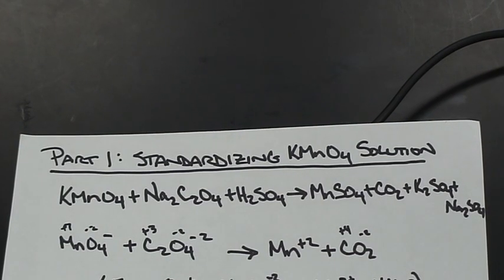This is Unit 4, Chapter 4, and we're taking a look at figuring out the strength of a solution. One of the ways of doing this is through doing a titration. I'll show you the apparatus in a moment, but I wanted to go through the concept of what this experiment is all about.